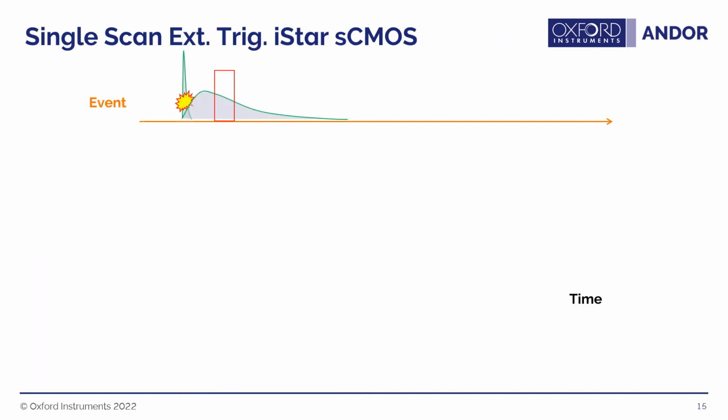So let's think about the timing of what's actually been happening here. In all of these plots, I'll show a couple of plots overlaid on top of each other, where if you go from left to right, you start from the beginning of time to later in the experiment. The event that we're actually looking at generated from the laser is happening on this line.